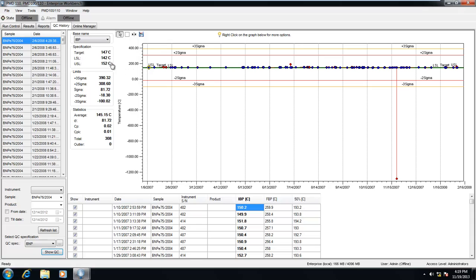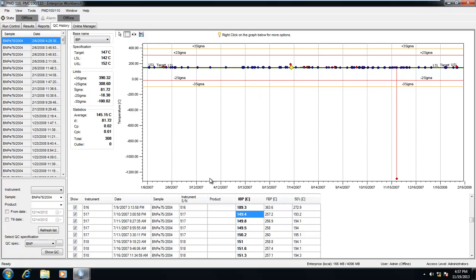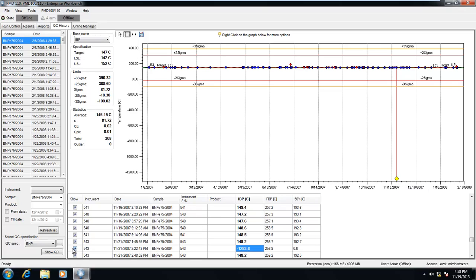When our graph is plotted, we have three sections. The first section is our statistical data — numeric values for target, lower limit, and upper limit for the given base name — along with sigma values, statistical mean, total data points, and any outliers. The next two sections are the graph and the table, which are linked. If the user selects a specific point plotted on the graph, the table value for that run will automatically highlight in the table below. The table includes all relevant information for that run: the instrument, the date and time the sample was run, and all three specification points associated with this QC. If a point is found to be erroneous, the user may select to disregard it by simply unchecking the box on the far left-hand side of the table.